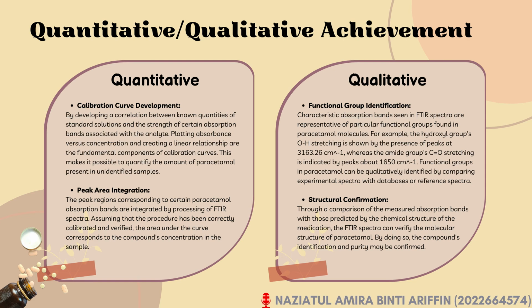For example, the hydroxyl group, phenol OH stretching, is shown by the presence of peaks at 3163.26, whereas the amide group, C=O stretching, is indicated by the peaks around 1650. Functional groups in paracetamol can be qualitatively identified by comparing the experimental spectra with database or reference spectra.